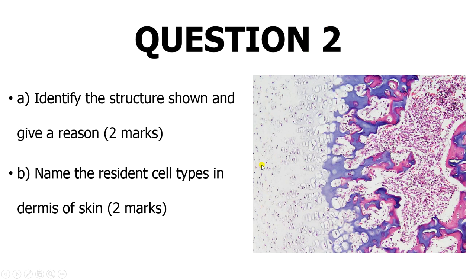Looking at the cell types here, you can see they are in different zones of development. We start from a resting zone, then move into a rapid phase of proliferation. Because proliferation is faster than the cells can arrange themselves, you get a palisade arrangement — like stacking coins on top of each other — due to that rapid proliferation.